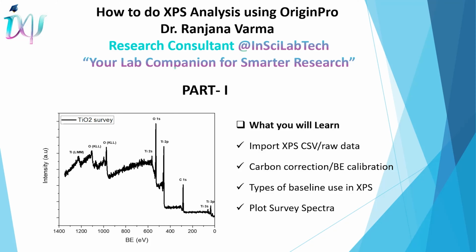As part of our For Researchers by Researchers initiative, I am here to show you how to perform XPS analysis using OriginPro. I have divided XPS analysis into three parts for clarity and accuracy. In the first part, we will see how to import the CSV or raw data file in Origin, how to do the carbon correction for binding energy calibration, and plot the survey spectra.